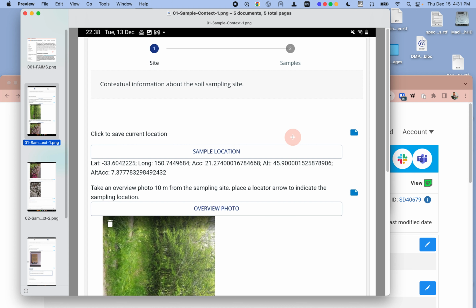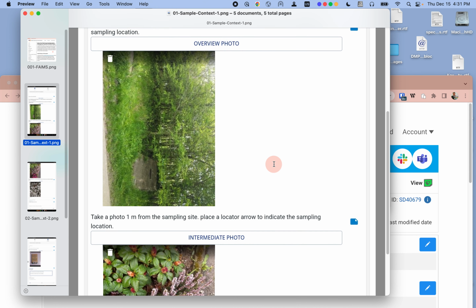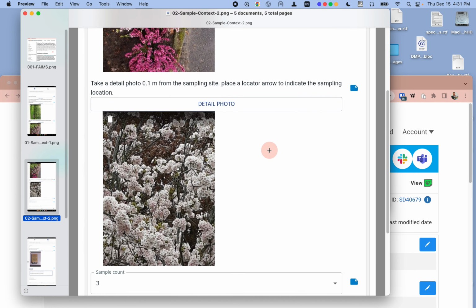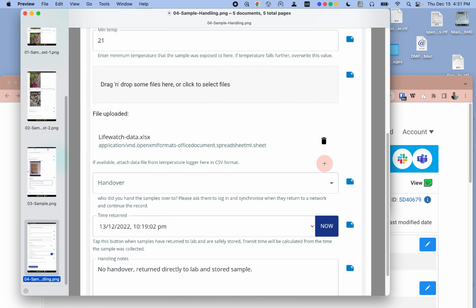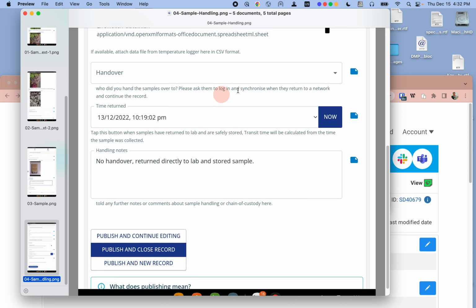This is a tool that would be used on an Android that could be used even if the phone were offline and has no connectivity at all. And you can see it's been set up to represent exactly the same sort of collection events that we used in RSpace. It's asking for the same kinds of information. The field site, information about the containers that the stuff was loaded into, and then ultimately information about things like the chain of custody. And then once the user is able to return to a location where there's internet connectivity, they can go ahead and sync this.